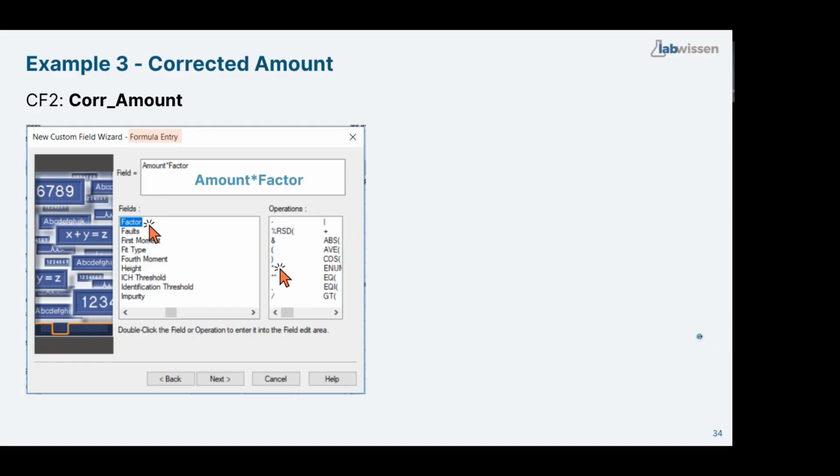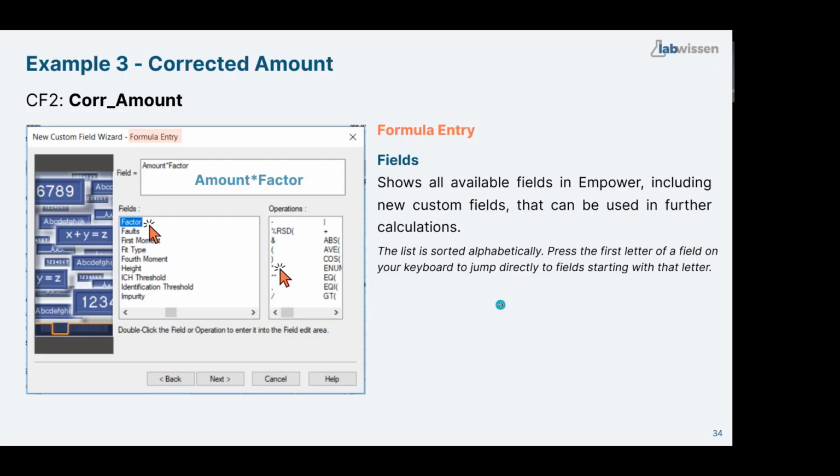So, and the next very interesting window, formula entry. So here we put our formula. We have here above a box where we type in our formula.